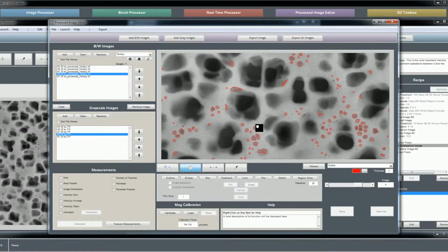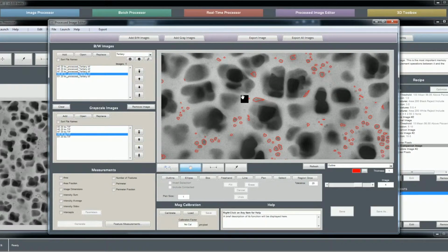Okay, so quickly, if we wanted to remove a mistake like this, we could do that in this environment. If you just click Select and either double click on the feature or click on multiple features and hit Enter. I'll double click on this one. You get a point. You can move that around if you want to reposition; any point within this feature is all you're shooting for. You're just clicking within this feature to select it, and then if you hit Erase now, that feature is erased.